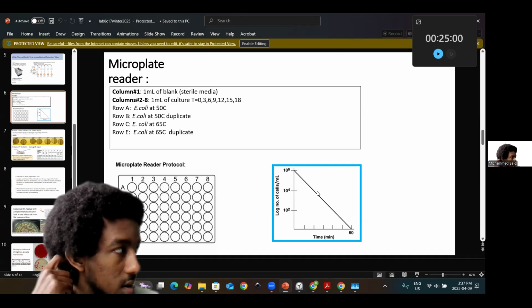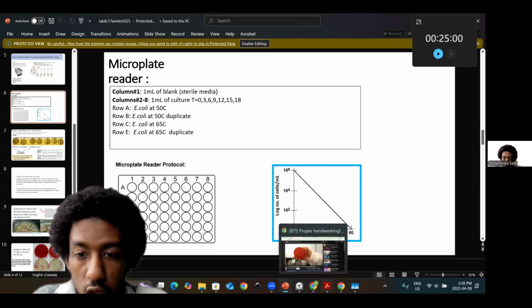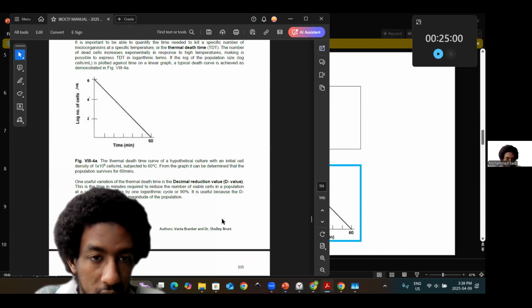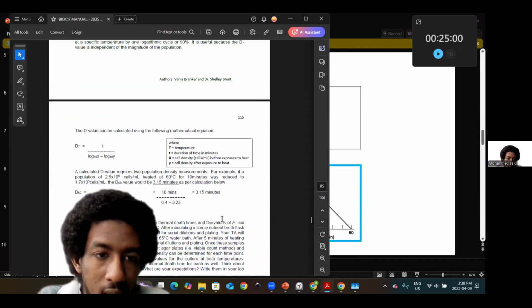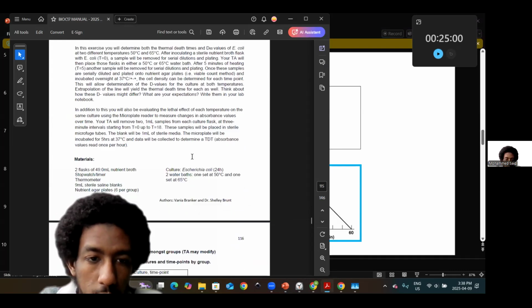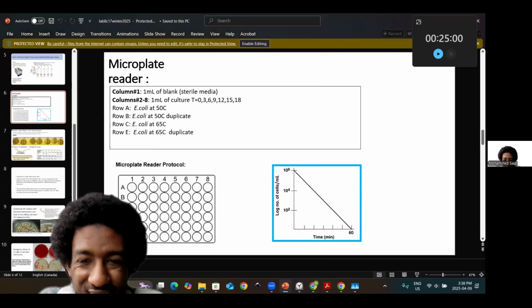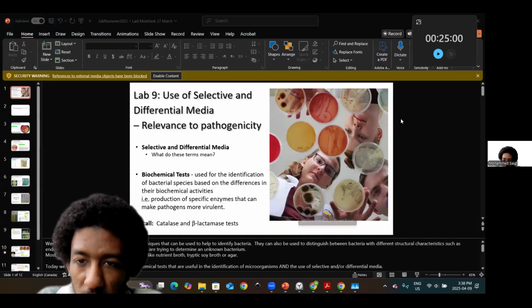In terms of understanding the relationship you would have for TDT, or the relationships you have across temperature conditions for the growth of your bacteria across density. So bear those details in mind. And then, pretty much a very simple calculation that you could consider. So think about these different components, and I believe that does conclude our analysis of week 8. So let's go to week 9, inshallah ta'ala.